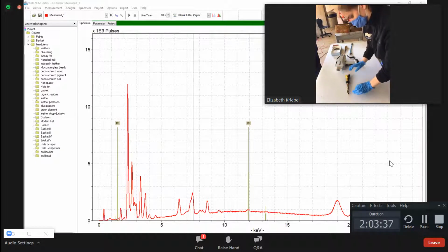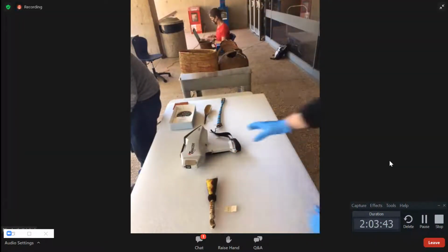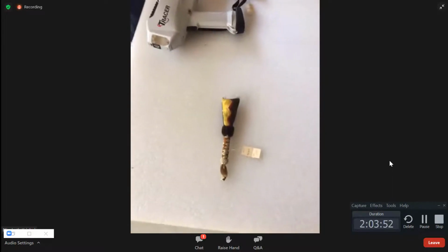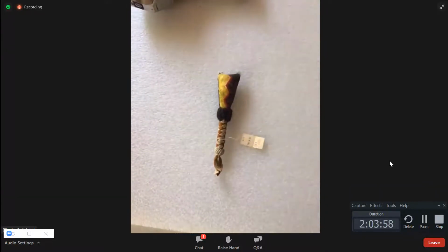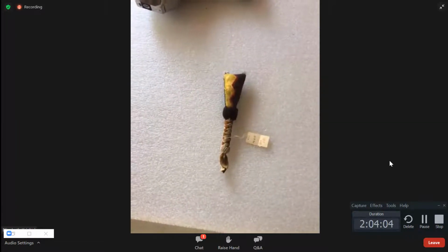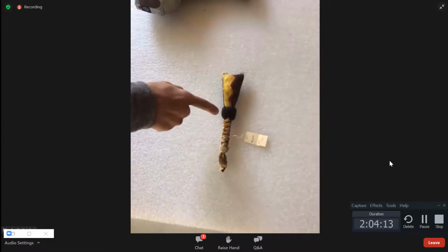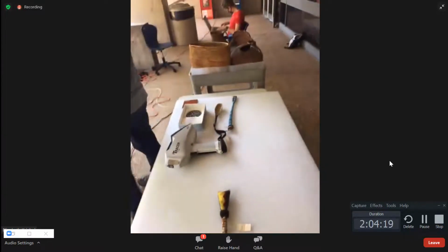And what is this? Here, I'm going to stop my share so people can see this because it looks bizarre. This one unfortunately doesn't have any note on the tag as to what it might be. We really need this one because I don't know where to start. But here, I really want to measure this yellow pigment. So what we're going to want to do is we'll measure here, then here, there, and then we'll get a couple of the elements down here. This one we'll need to do quite a few shots of, I think.